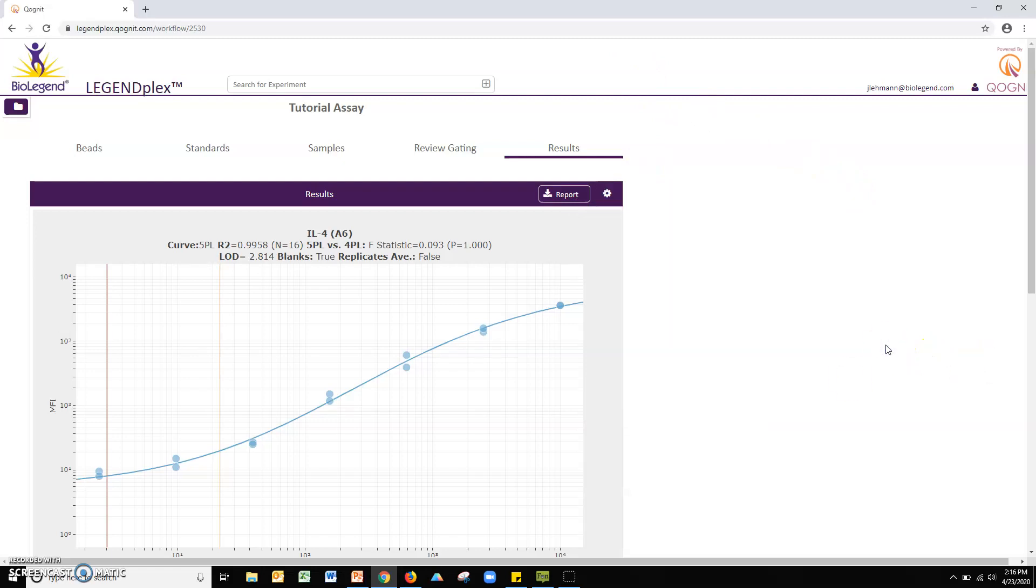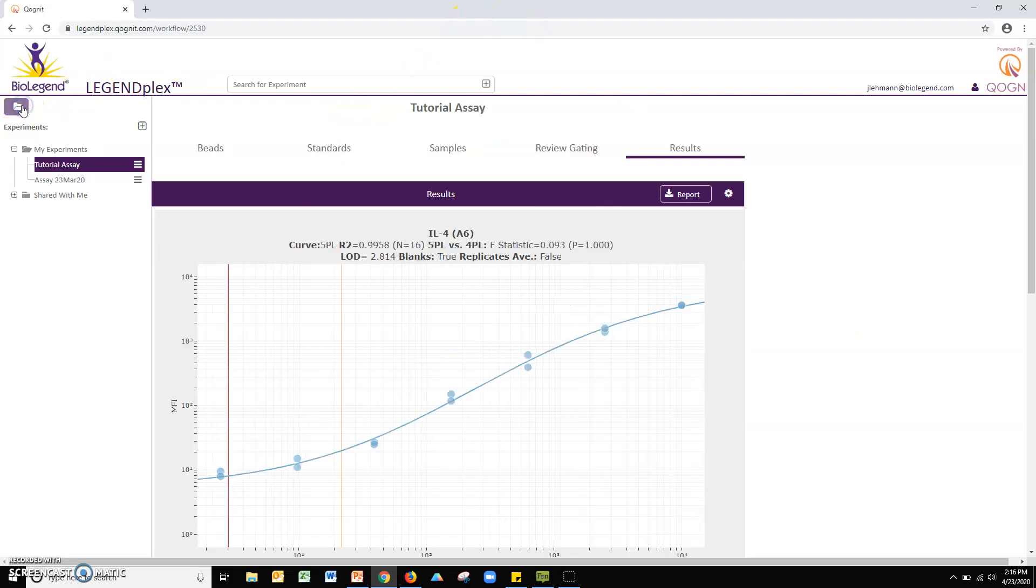One of the most exciting features in the software is the ability to instantly share your experimental workspace with other user accounts and with BioLegend Technical Service. To access this functionality, click the purple icon folder. Find your assay and then click the three bar icon to the right.